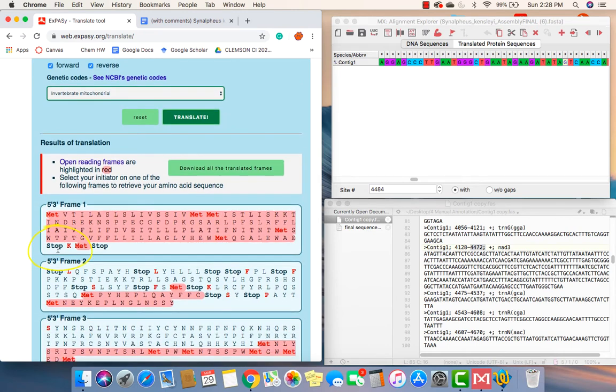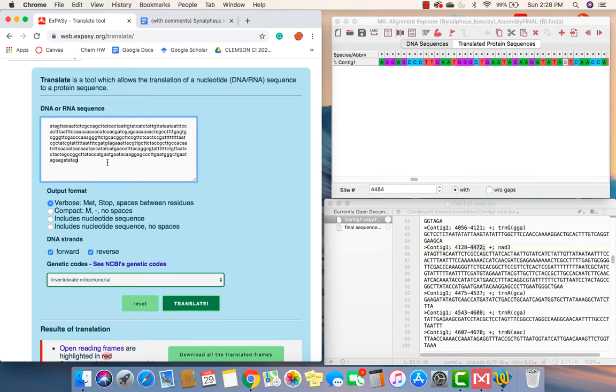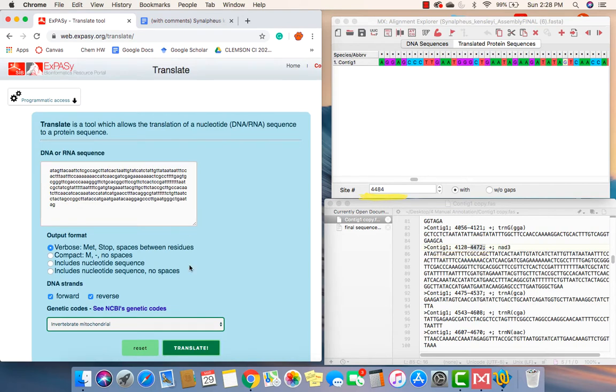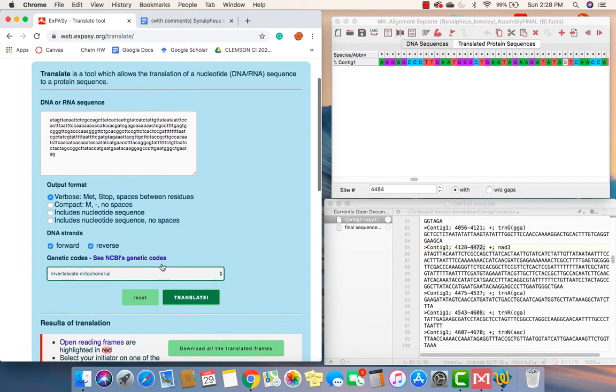As you can see, I have found a potential stop codon, but I have copied a little bit too far. This is where I will then go back to the sequence and remove the extra codons in order to find where the correct location of the stop codon is. A good tip is to pay attention to the location which you started at and you copied to in order to find the correct location of your start or stop codon.